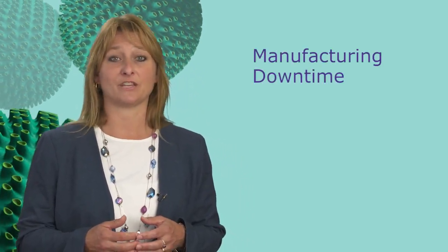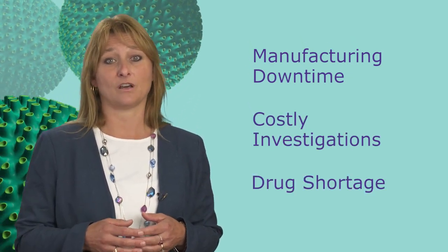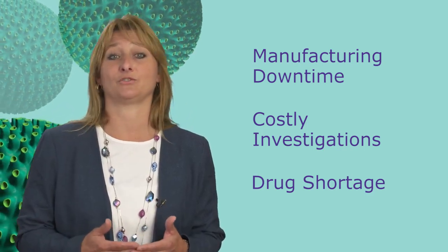Regardless of where your raw materials come from or the treatment, the goal is to prevent viruses from entering the system. Since once in the bioreactor, a virus particle could amplify to a level that may or may not be detected by in-process tests. This contamination presents a risk to your entire downstream process, resulting in manufacturing downtime, costly investigations, and worst of all, the potential shortage of life-saving drugs.